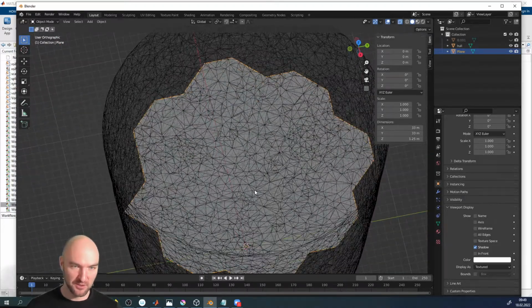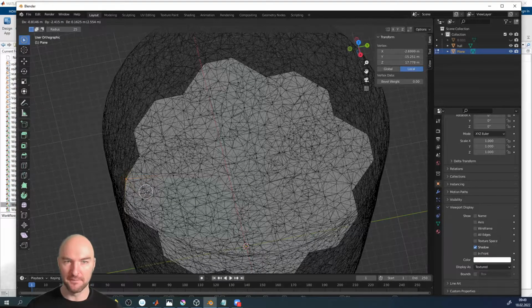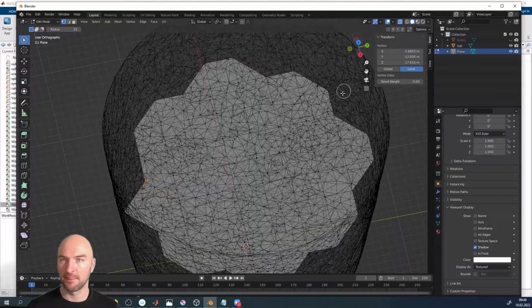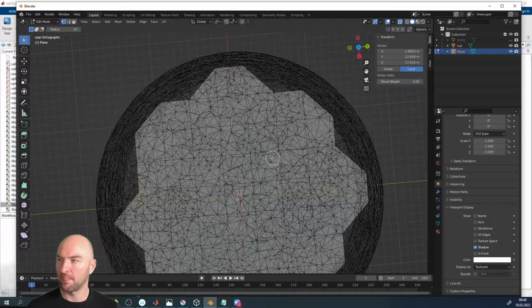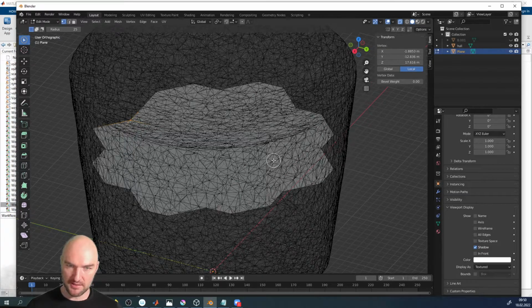So what can we do on top of that? Peter? Just quick, could you say again how you can add some faces? If you want to add faces, you just mark the vertices that you want to belong to that face. Let me switch off the hull again.